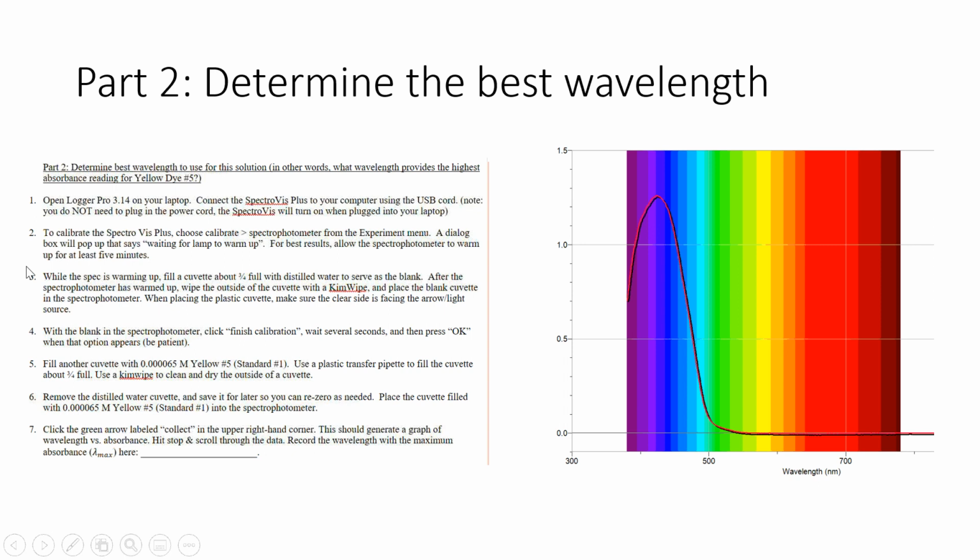is to figure out what wavelength of light your solution absorbs. Because we said that your solution will absorb light, but it turns out there's lots of different kinds of light, right? Like the white light that's coming in through the window is actually made of a lot of different colors, and we can describe the different colors of light using their wavelengths.